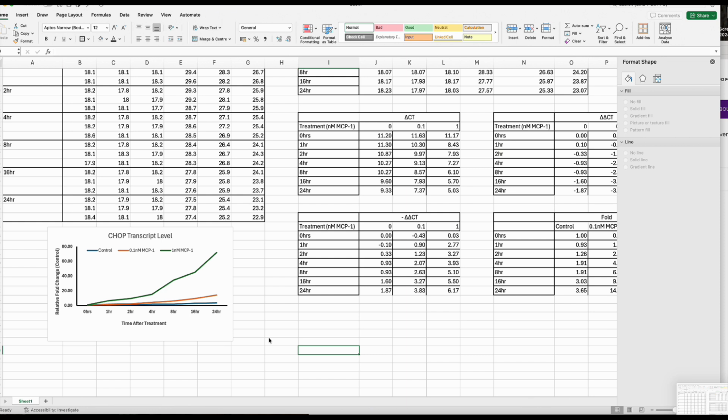And so this is the final piece of data. This is what your graphs should look like when they're all cleaned up. And you tell me what it means. It seems pretty obvious what happens when you have a treatment and a particular treatment level over time, but you interpret what it means. You not only tell me what is happening with the treatment group, you tell me not only what is happening, but when it is happening.